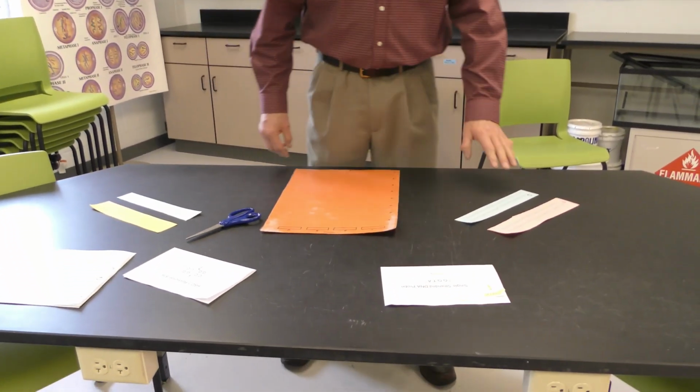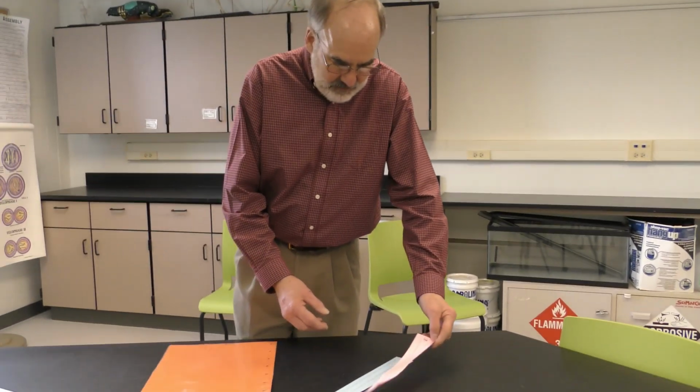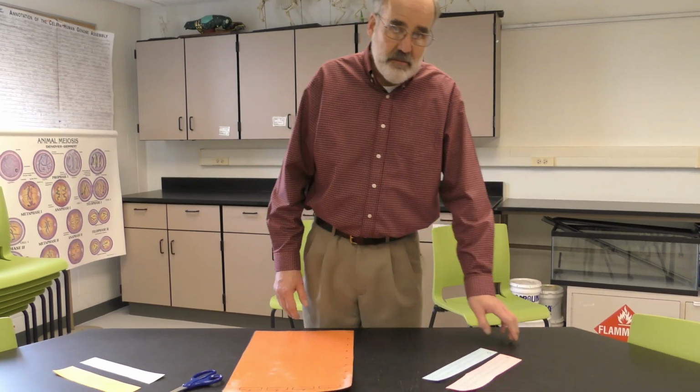Basically, for DNA fingerprinting, you start with the DNA fragments. In this modeling exercise, you're going to have four different DNAs that we're going to analyze. DNA 1 is pink, DNA 2 is blue. The only difference between DNA 1 and DNA 2 is a point mutation. One base was changed in DNA 1 to create DNA 2. The question you're asking is, how will that affect the DNA fingerprinting profile? Will the DNA fragments migrate the same, or might they migrate differently?